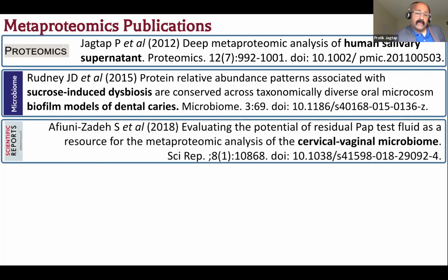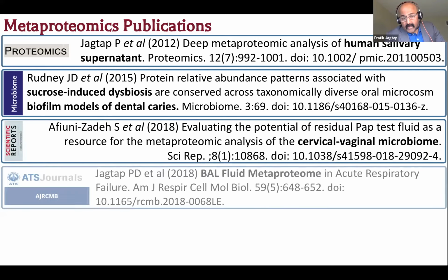We also worked with researchers at the University of Minnesota. Professor Amy Skubitz had data from the cervical vaginal microbiome, and again, as with the salivary supernatant, they had initially analyzed it for the human proteome, but later we decided to look deeper into this data, and we did find that there are quite a few bacteria that we could detect through the same data set.